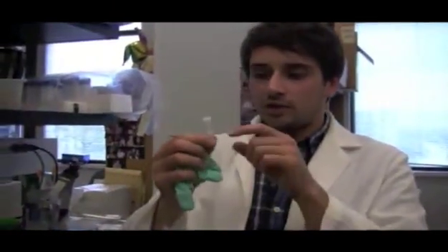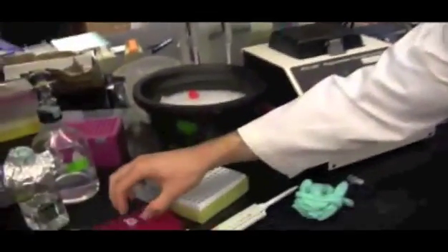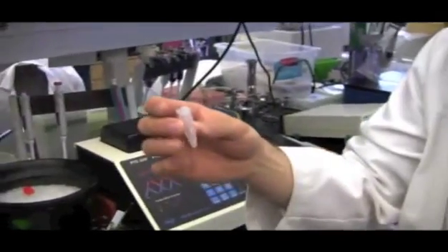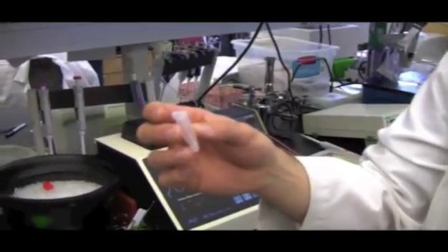So we need to get rid of the gel itself and all the other nonsense in here, so we can purify this a little bit more, and I conveniently did that a little bit earlier today. And so it all comes down to this teeny tiny little speck of liquid. This is a purified piece of DNA. It's only our DNA that we're interested in, that tells the cell how to make our protein.